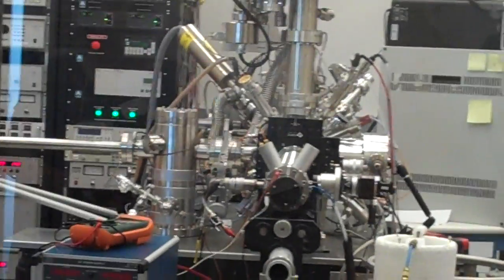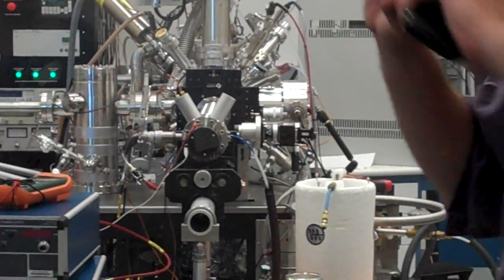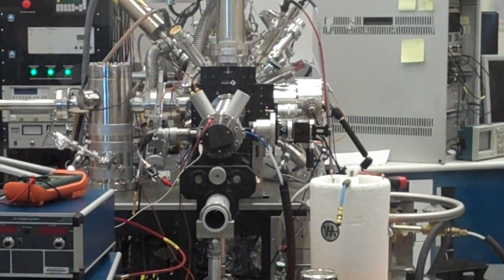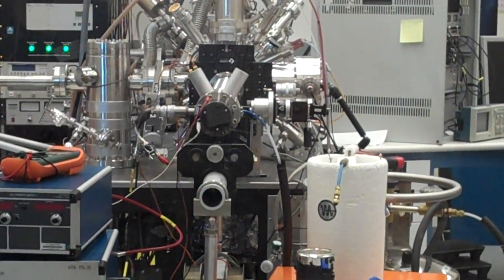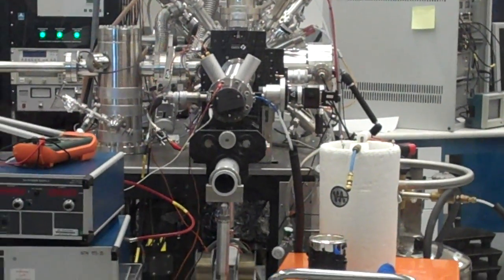Here they have part of it that's in an ultra-high vacuum. They can do sample preparation, then they can move that into another portion where they expose it to some gases. They have a scanning tunneling microscope. They have some other things - ion scattering - they can shoot ions off of it. That gives you slightly different information.